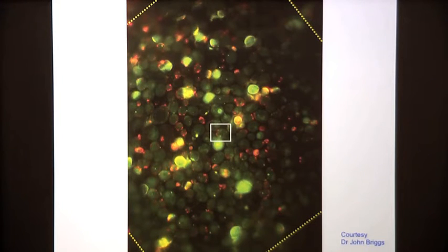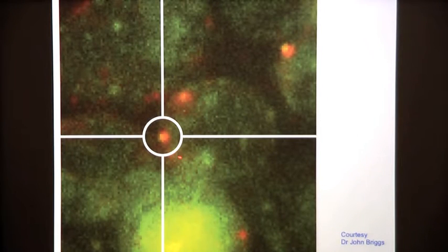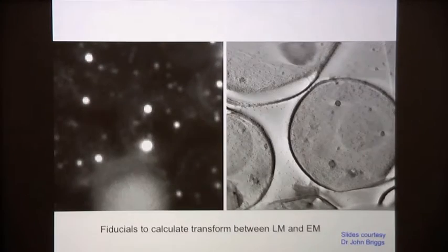Using this fluorescence, you could focus in on a region of interest, for example, that cell, and for example, that position, which is some sort of endocytic intermediate. Even though you have a low resolution light microscopy picture, you would like to have a high resolution EM picture of the same thing. Some fiducial markers were applied previously to the cryo-EM grid.